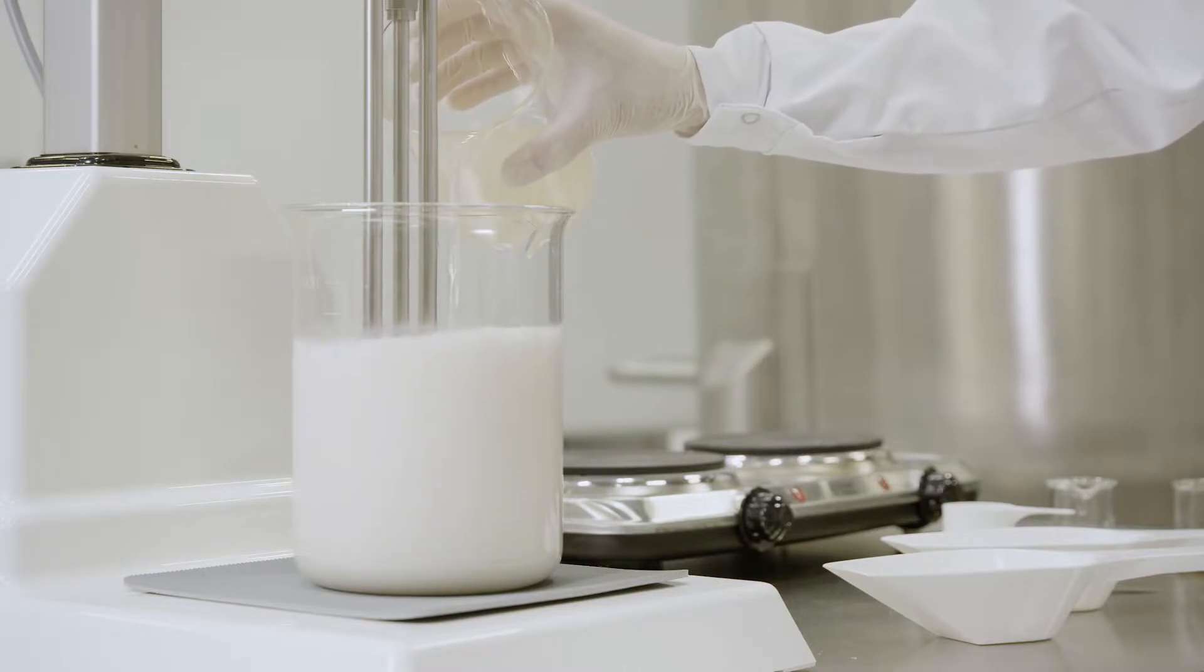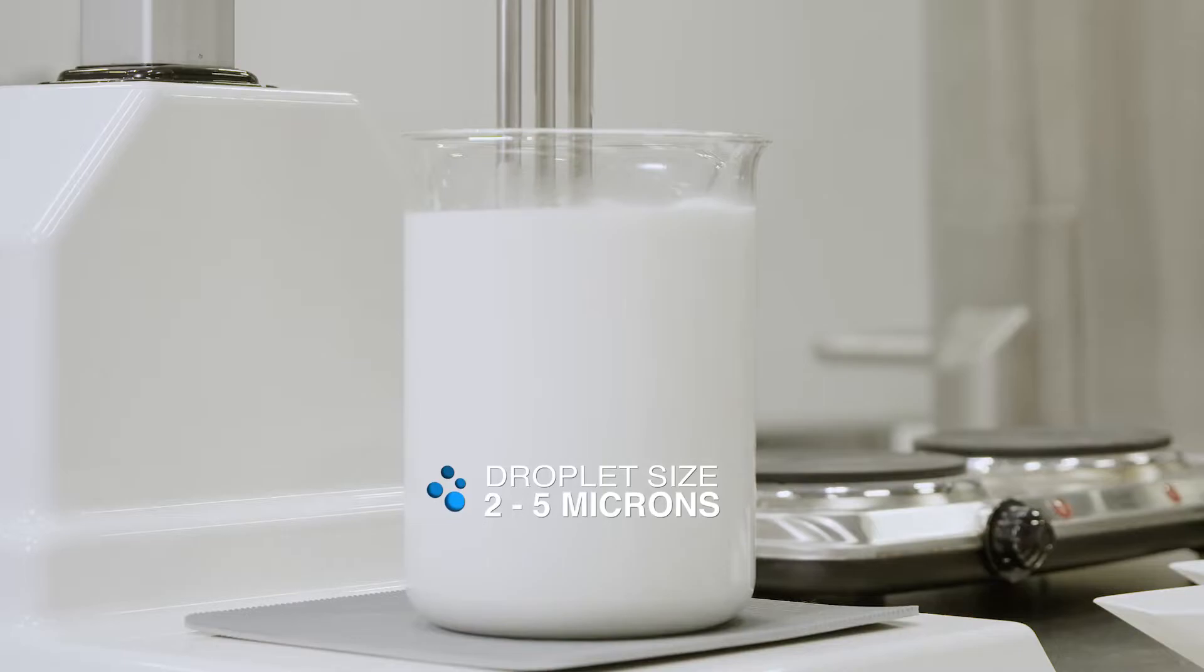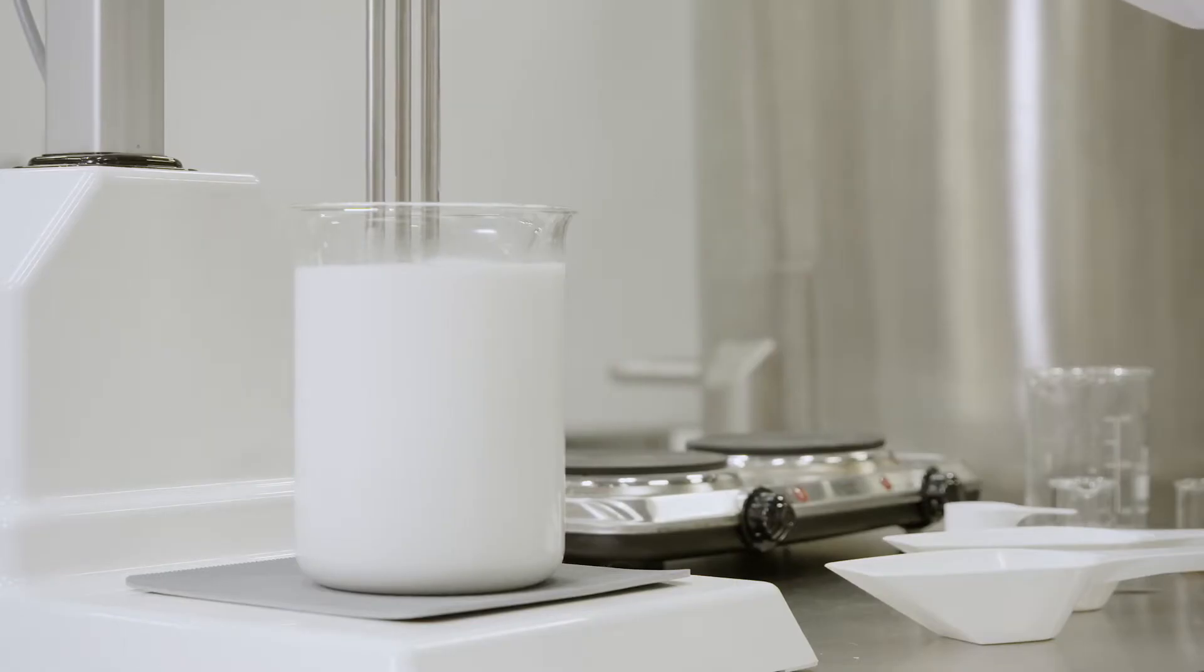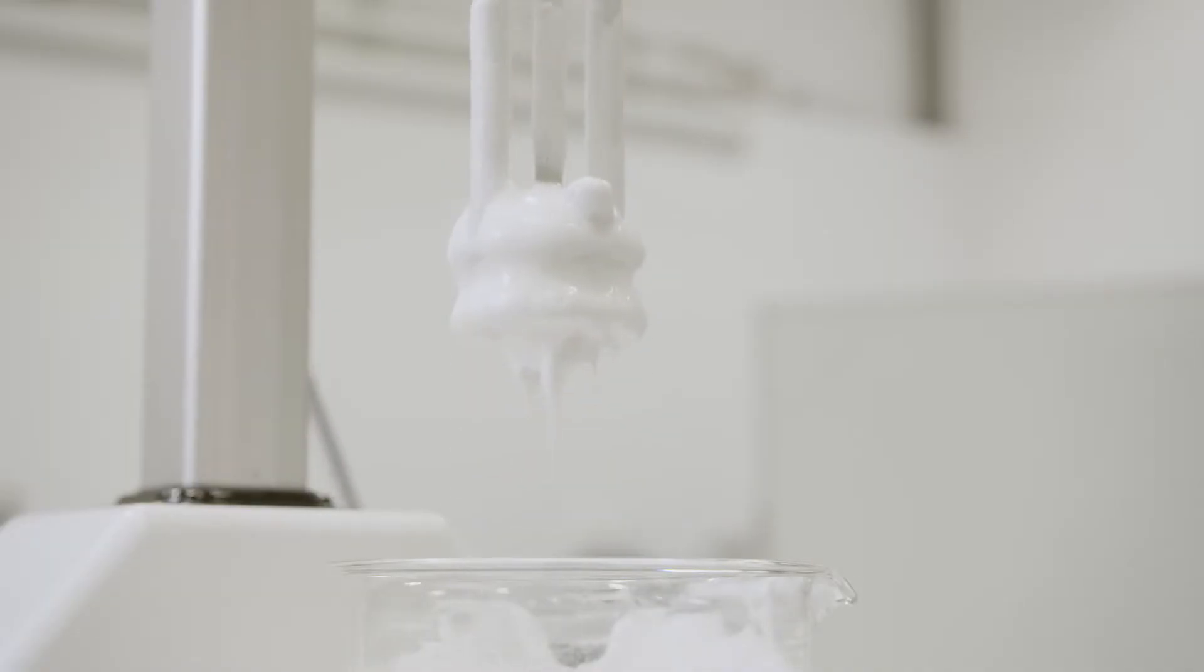A Silverson mixer can easily create emulsions with a droplet size of 2 to 5 microns. Finer emulsions down to 0.5 microns can also be obtained, depending on the formulation.